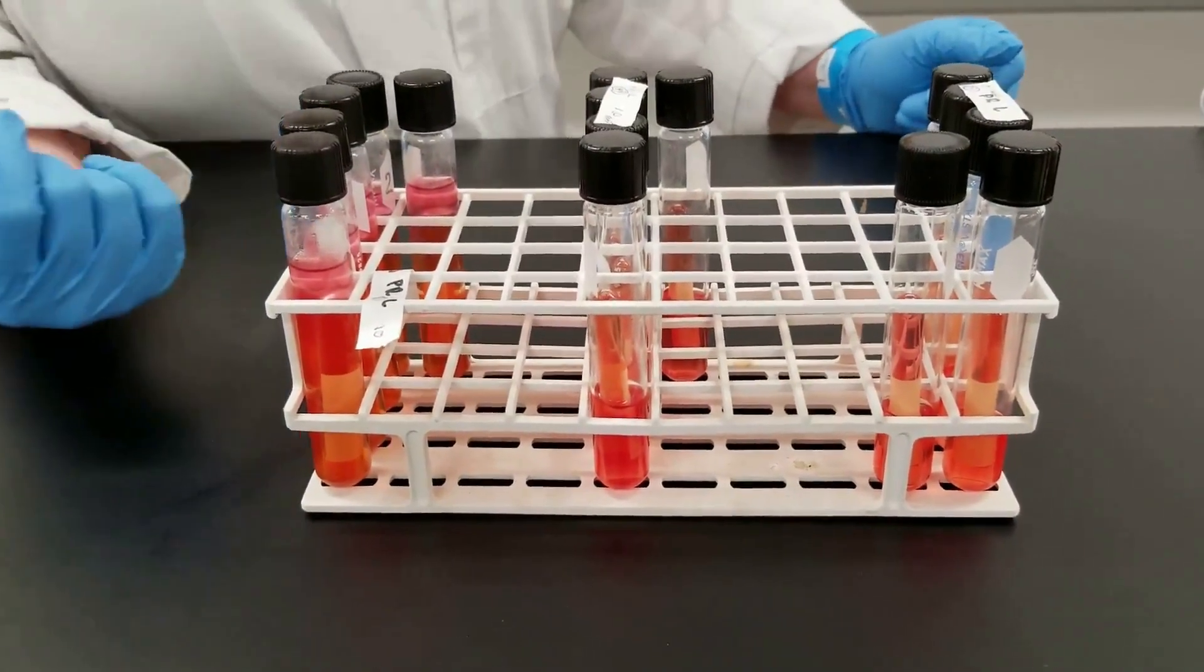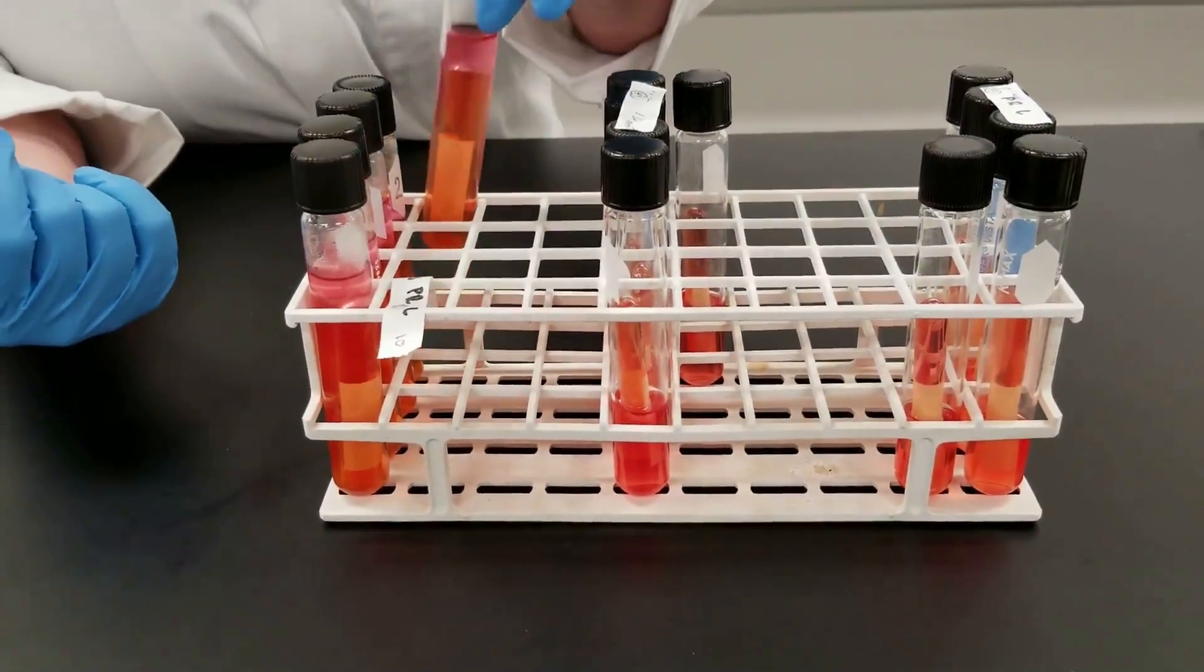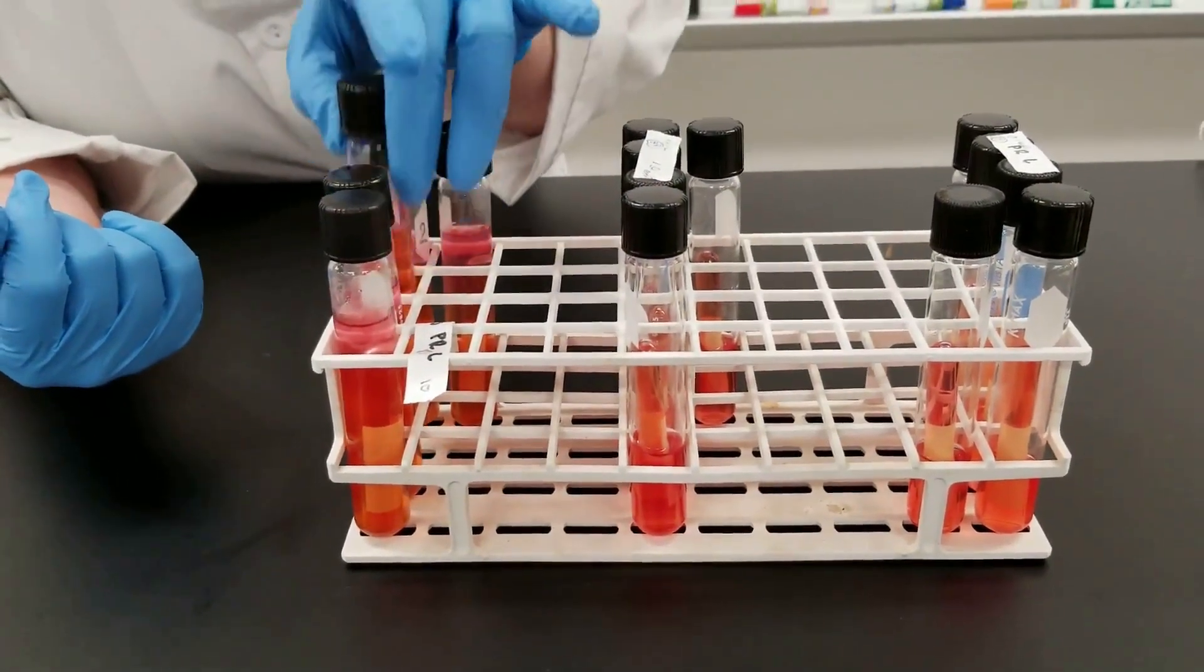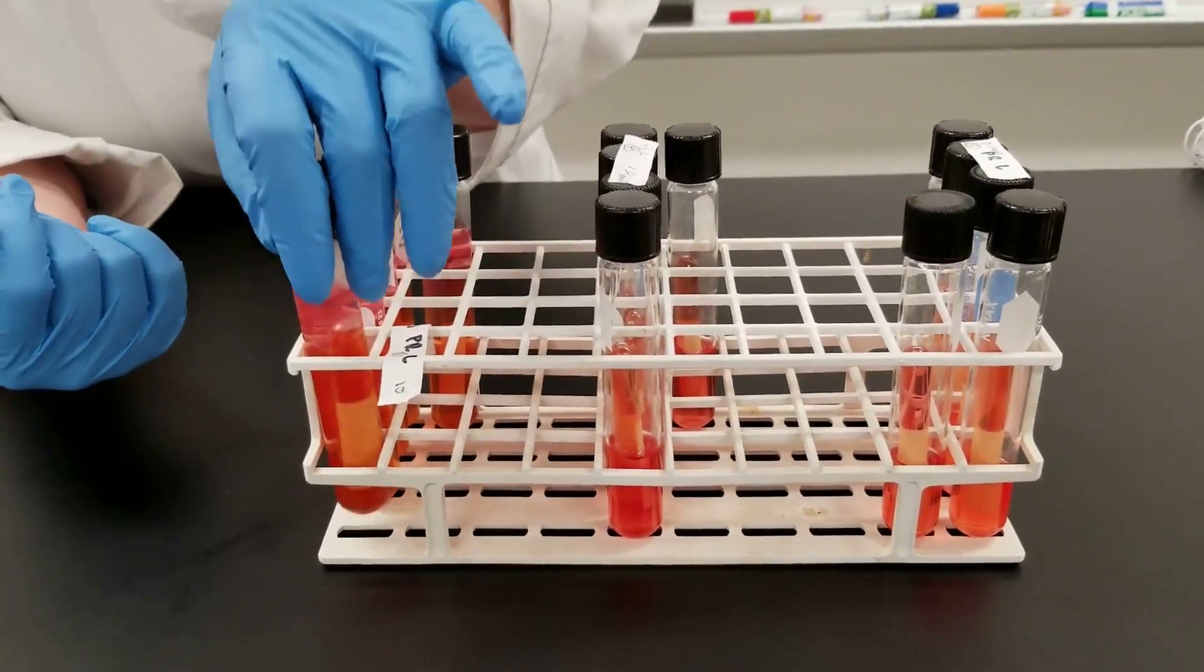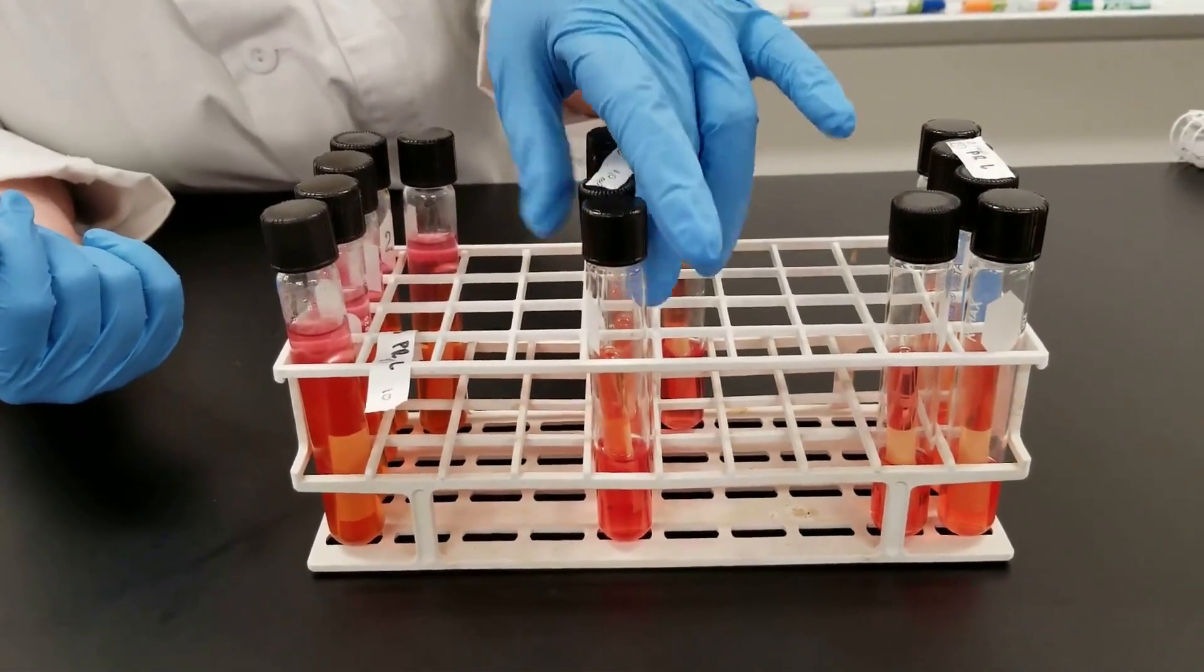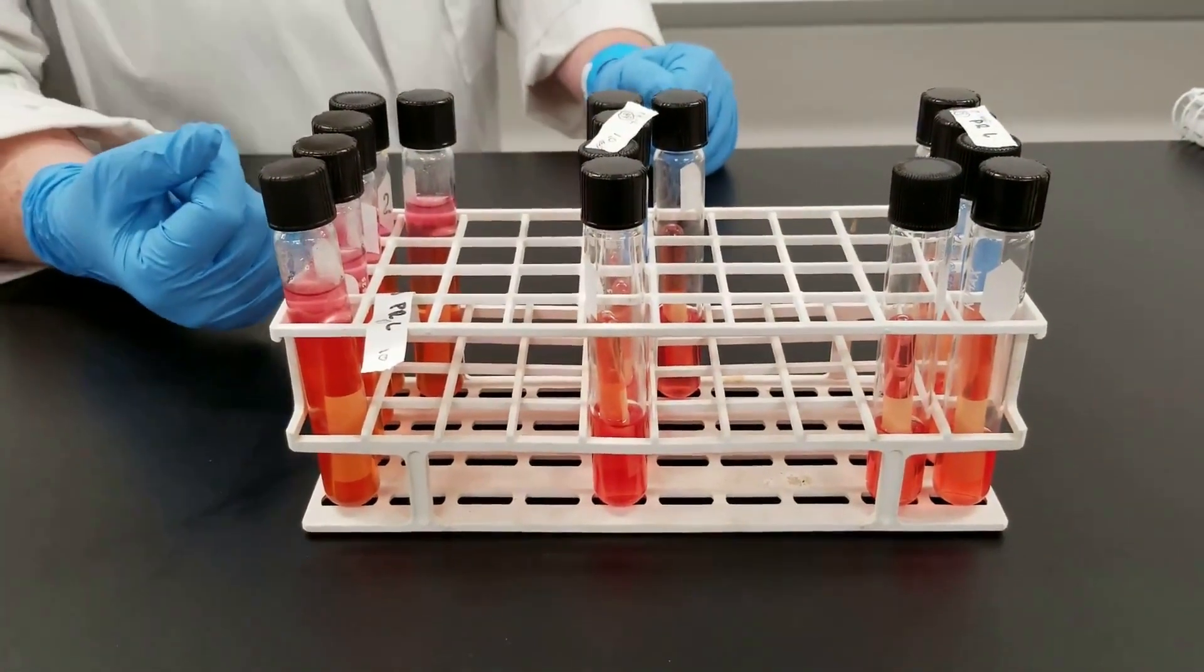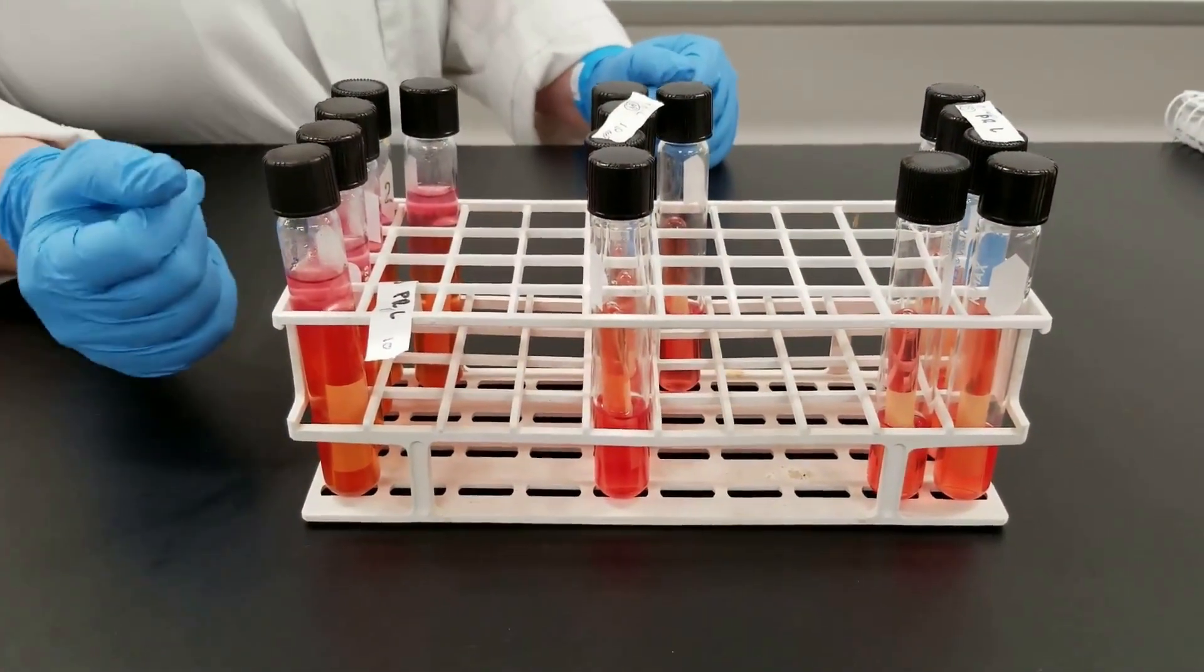On these particular samples, you will notice that none of them have turned yellow. It is possible if we left them a little bit longer, they might. But on the other hand, it's good that this obviously is a fairly clean water sample in terms of enterics that may be present in it.